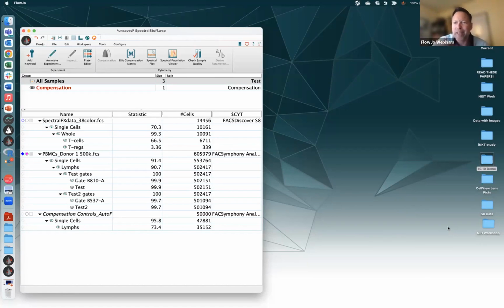Last thing to show in this works, and sorry, I'm getting over a cough, so my voice sounds like this, and I'm going to go every few minutes.